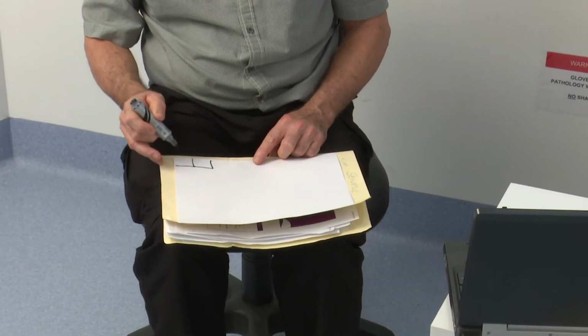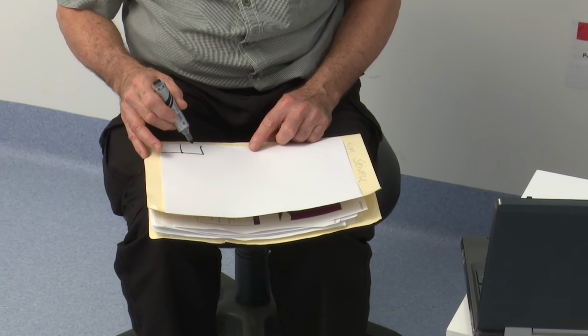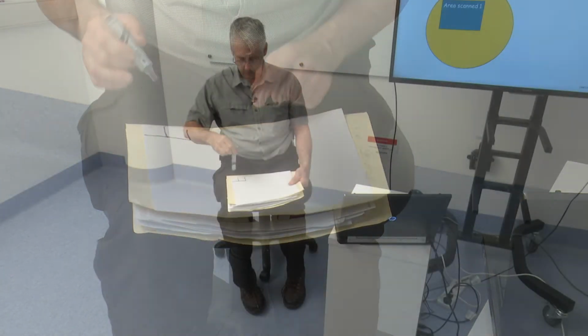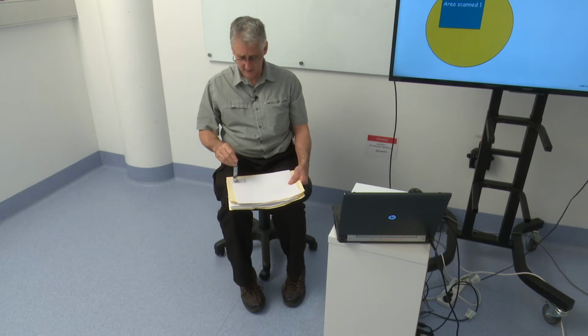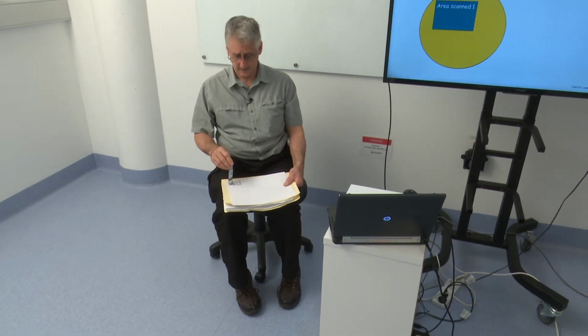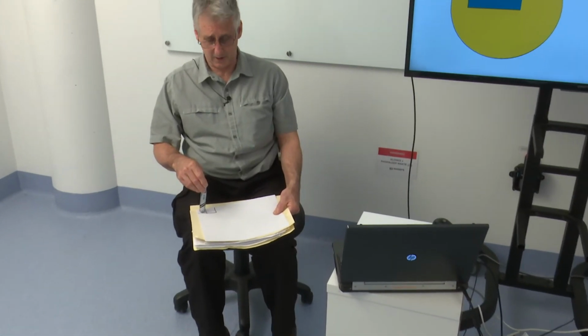So this is pixel 1,1, this is pixel 1,2. If we imagine that this pen is an electron beam, what we can do is hold it at the first pixel point and generate signal from the sample, collect that signal, and if we get a certain amount of signal, we can produce a bright point on the screen of our SEM. If we then move to the second pixel, pixel 1,2, and get less signal from there, we get a dark point on our screen.